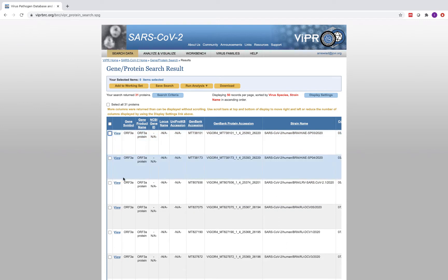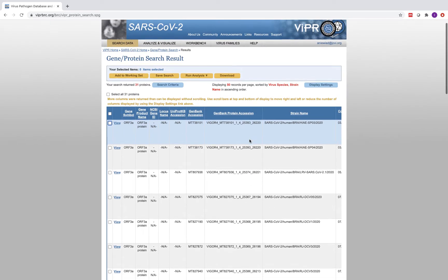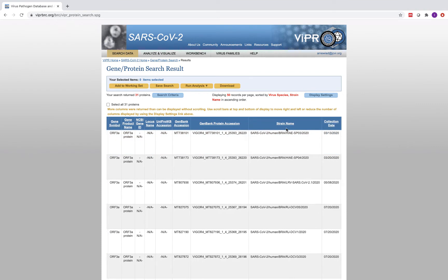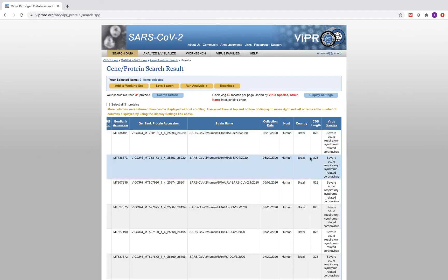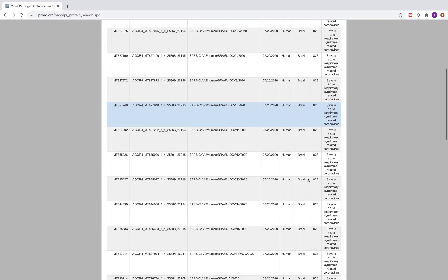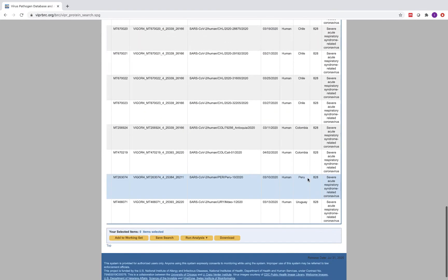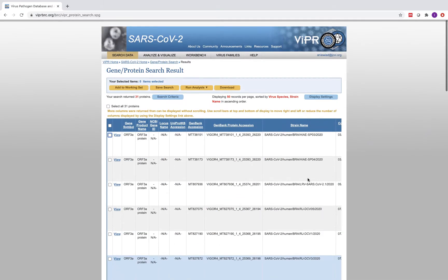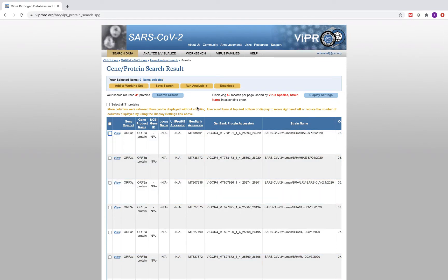After clicking Search, the results show the gene symbol, gene product name, GenBank accession number, GenBank protein accession, strain name, collection date, host, and country. There are sequences from Brazil, Chile, Colombia, Peru, and Uruguay. One of the nice things about Viper is that it's seamlessly integrated, so you can run analyses directly on search results. I'll click Select All 31 proteins and then Align Sequences.